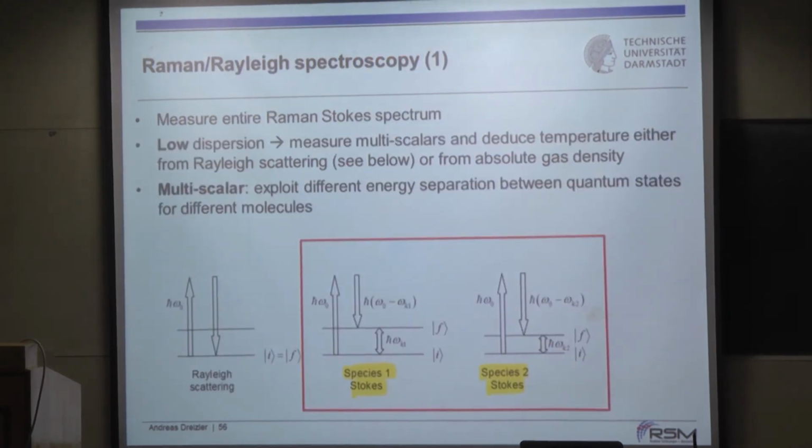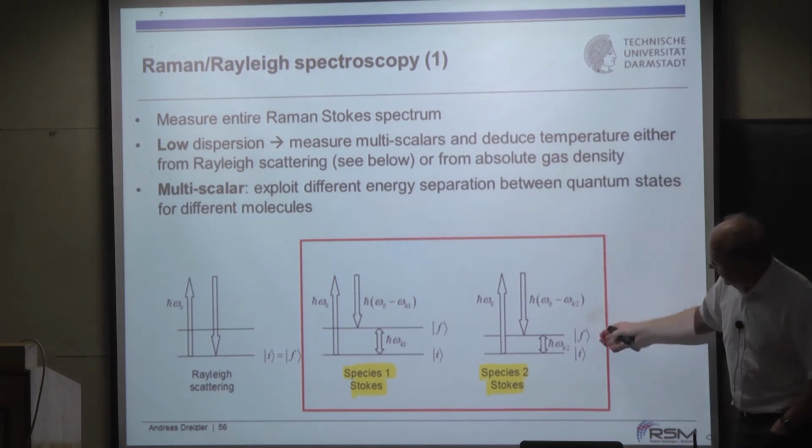And so typically it is done in such a way that you measure multiscalars with Raman, as I've pointed out here.